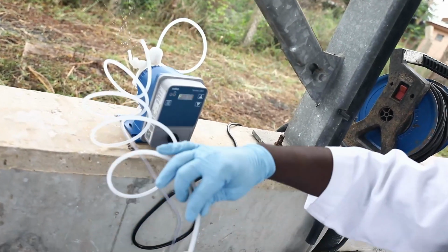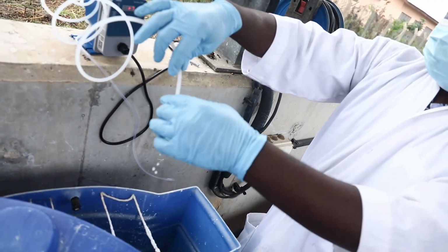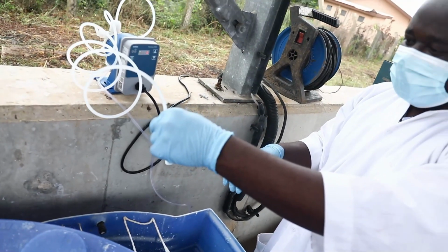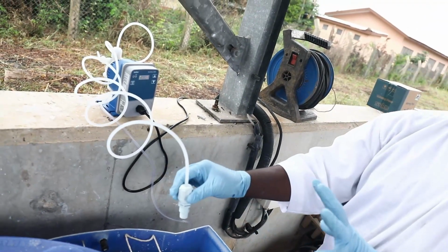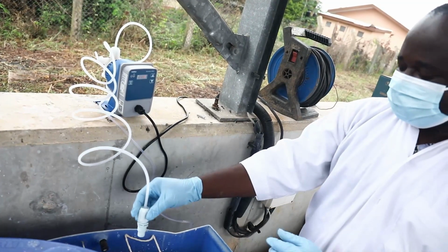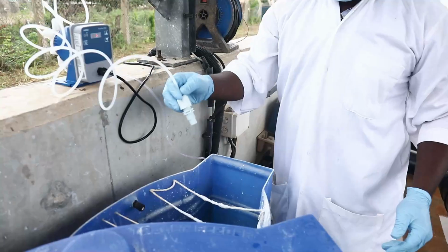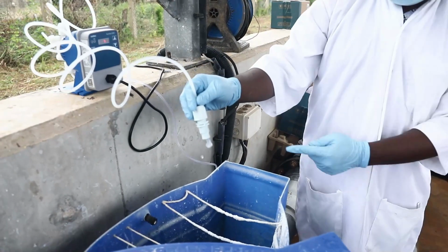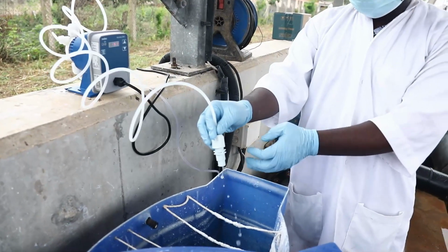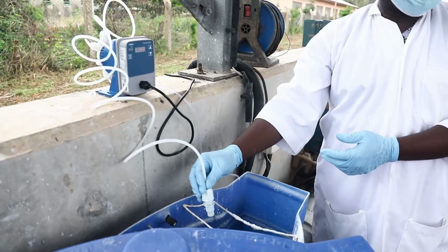So you can see that now the solution is coming out from this end. Okay. So we just wait a while to make sure that there's no air bubble in the line. So now the system is dispensing the stock into our treated lines. Okay.